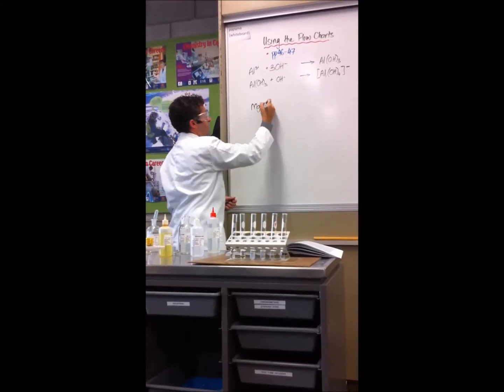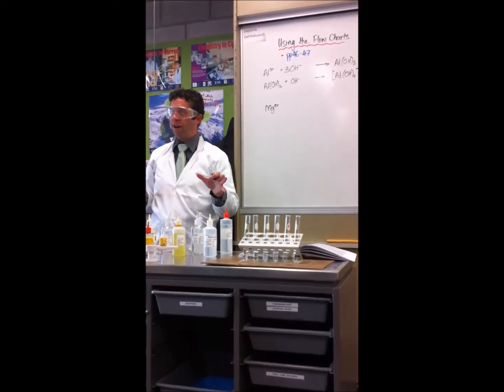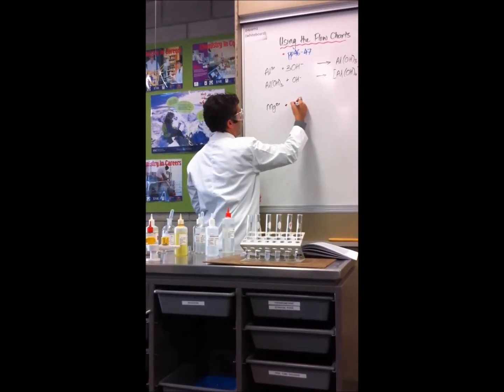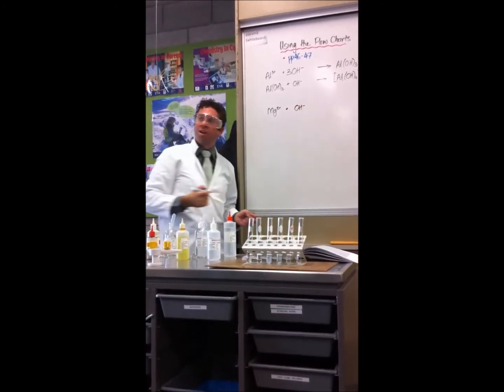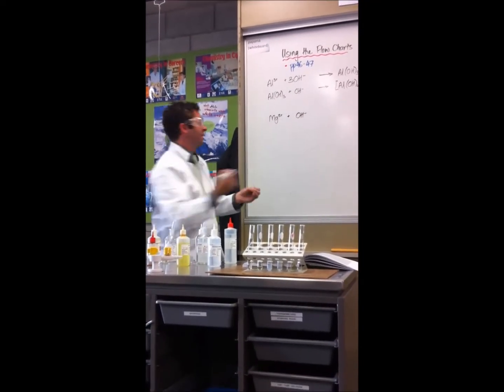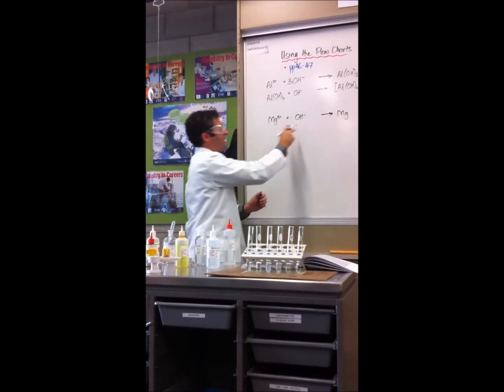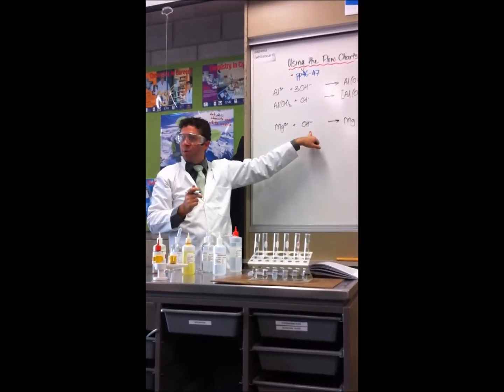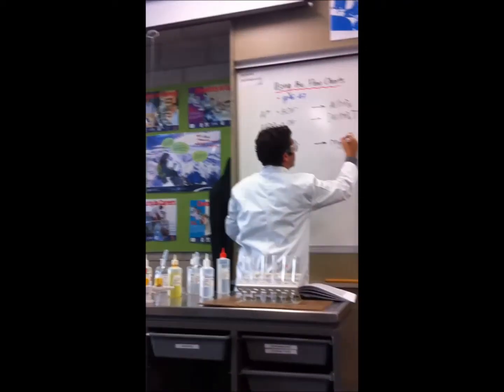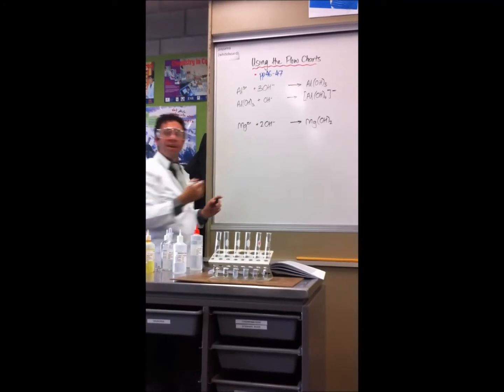It's only the magnesium that reacts, not whatever anion is in there. We haven't worked out the anion in this. Reacting with the hydroxide from the sodium hydroxide, so I'm getting rid of the spectator ions. Now to do the balanced formula for this, 2 plus means there needs to be 2 of those, the 2 minus, which means I need 2 there.